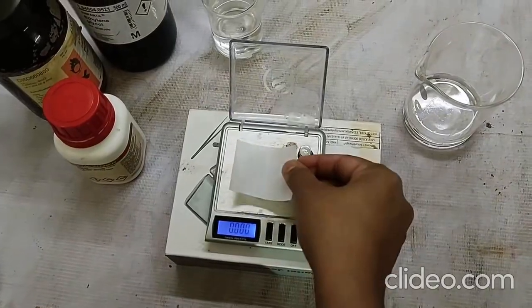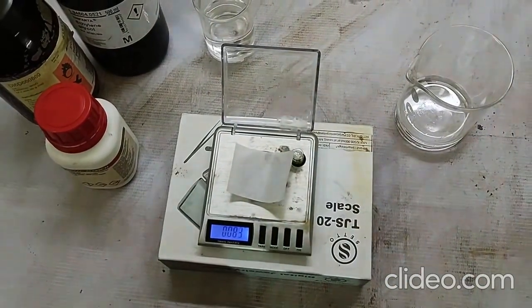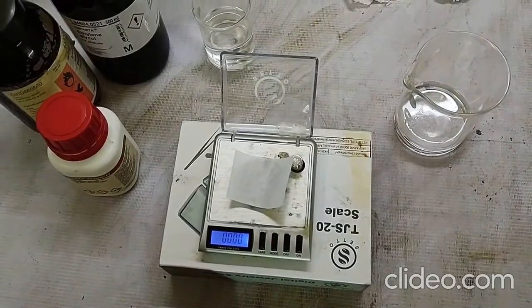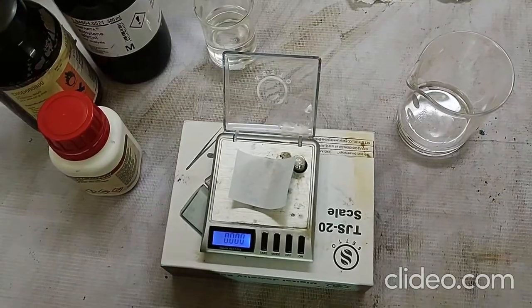First, we take a butter paper and place it on the weighing machine. Then we can tare, and next 0.727 g bismuth nitrate is required.